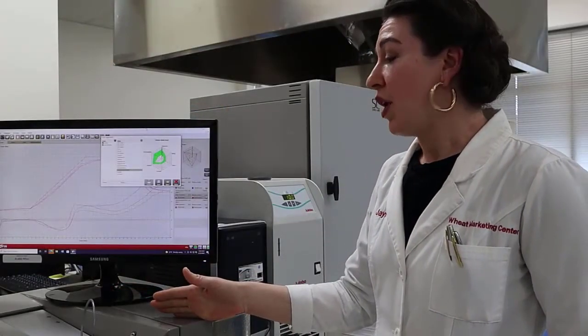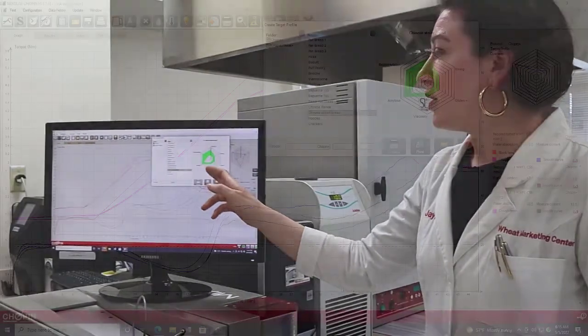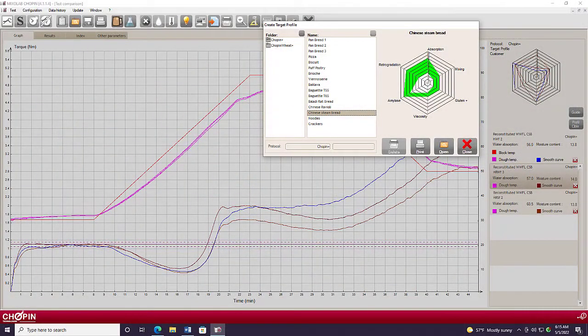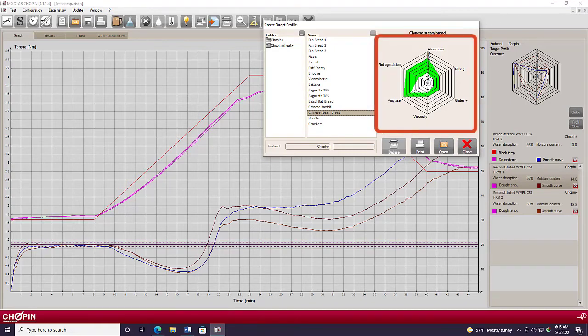How can the MixoLab be used to improve the communication between Miller and Baker? One of the functions that the software offers is this six-point spider graph characterizing each flour. So what I've done here is I've loaded the curves for three different flours that we were using for Chinese steam bread production. And I've also loaded our Chinese steam bread profile here.